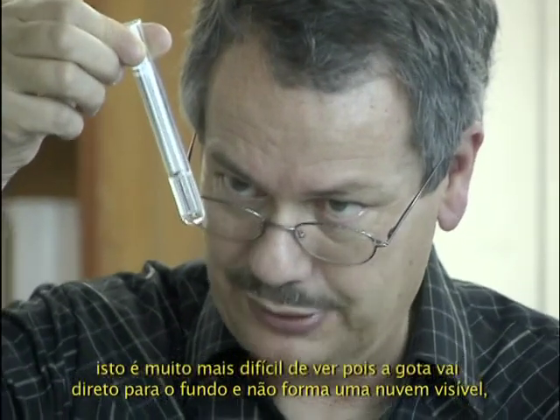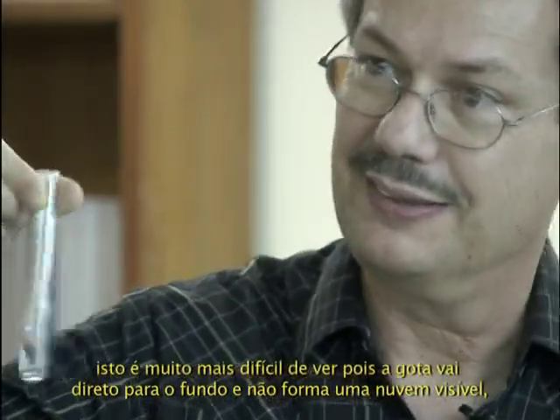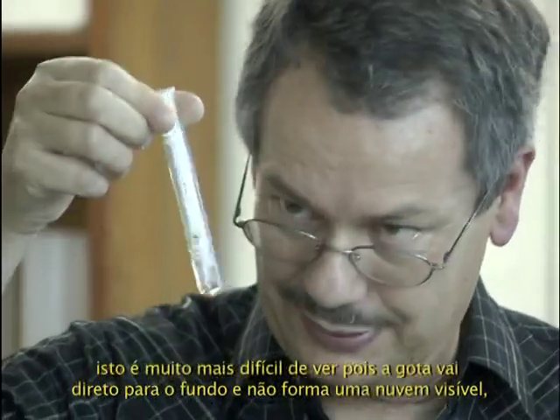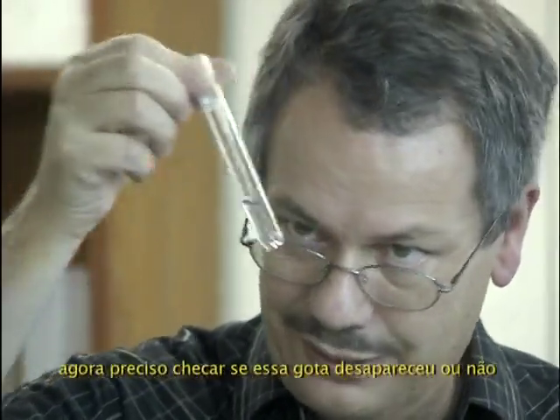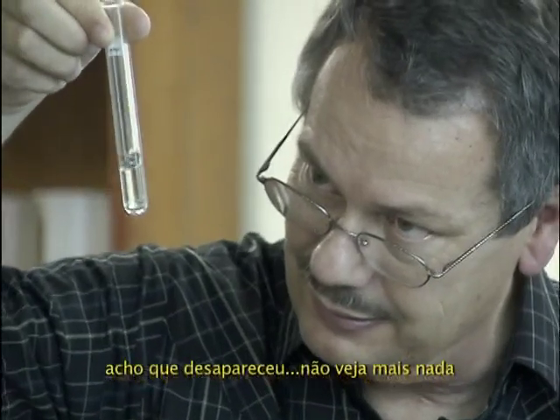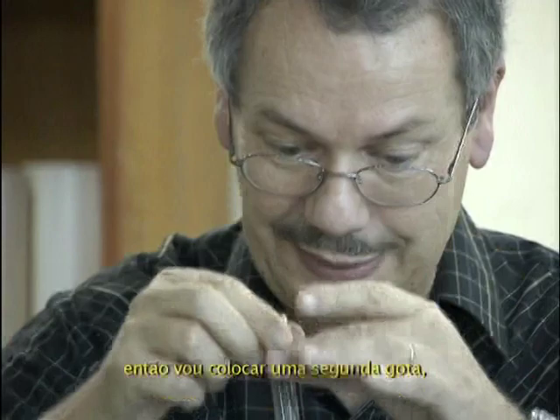This is much more difficult to see because you get a drop going to the bottom directly, not making a clear cloud, and now you have to check if this drop disappeared or not. I think it disappeared. I don't see anything more. So I go for a second drop.